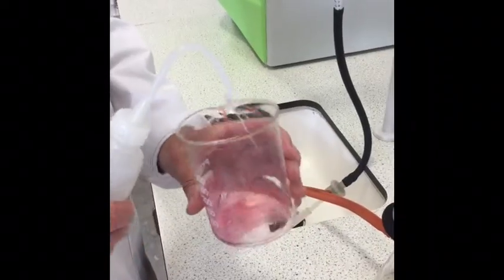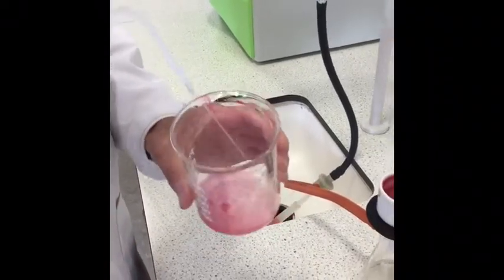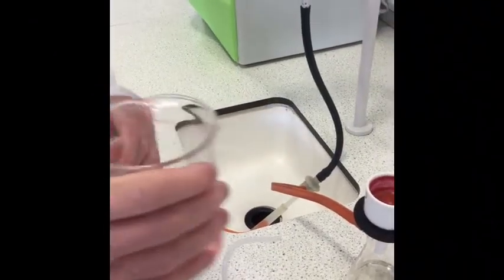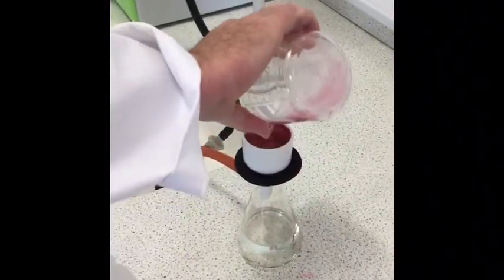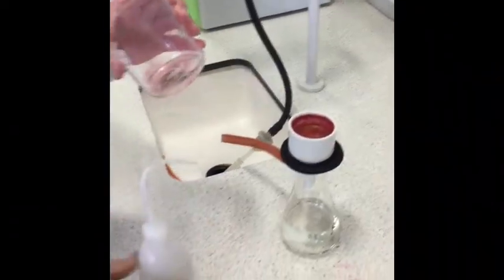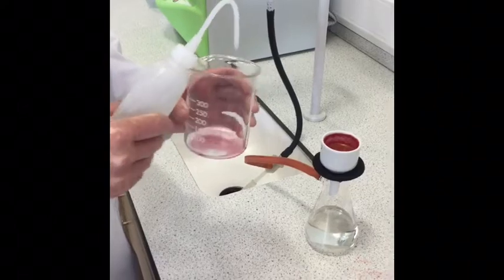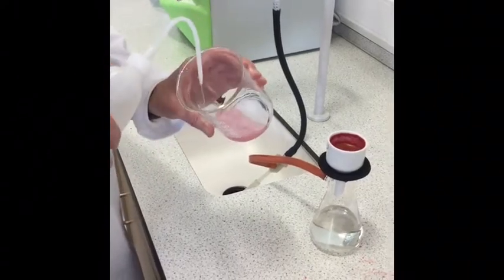So I'll do this 2 or 3 times, to try and transfer as much as possible of the red precipitate into the Buchner funnel.